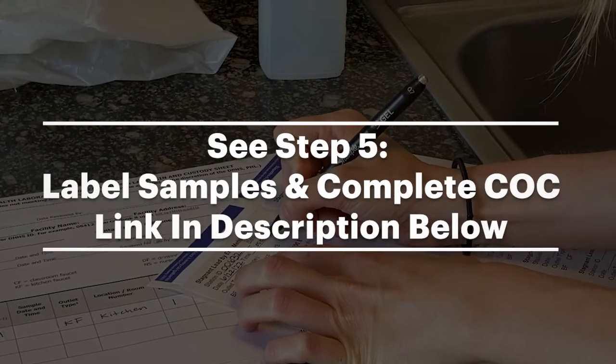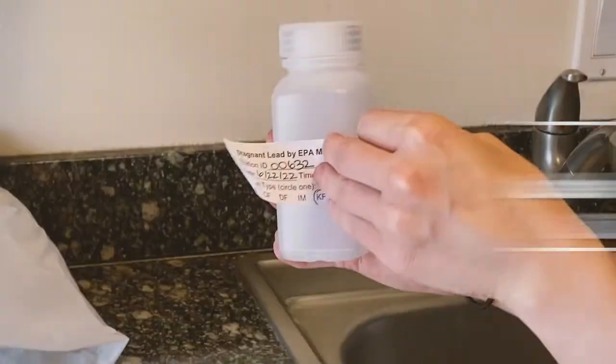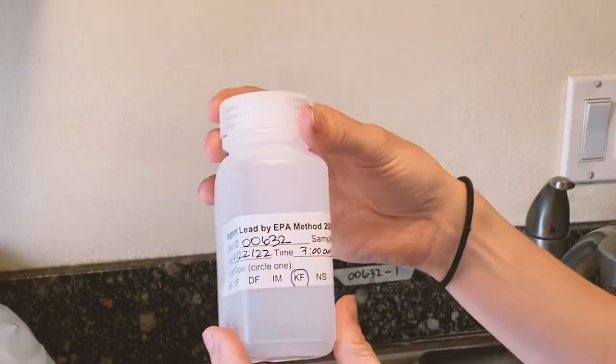See the Label Samples and Complete COC video for more detailed instructions on how to fill out the labels. Once the label is filled out, place it neatly on the sample bottle.